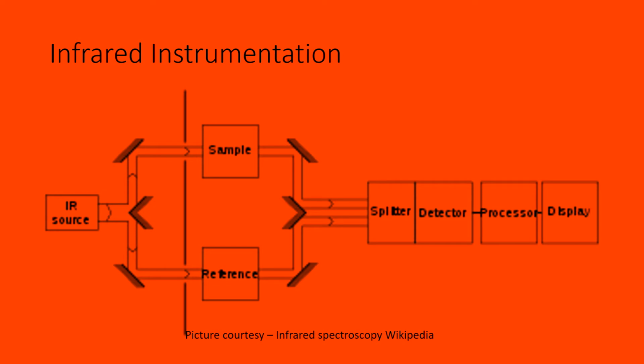See, this is a simple schematic of the basic of the instrument. It contains a source lamp for infrared range. Generally, Nernst glower is one of the sources for IR range. There are beam splitter, detector, processor, etc. All these items are very sensitive to moisture attack. So you have to be really careful to see that the equipment is protected well.